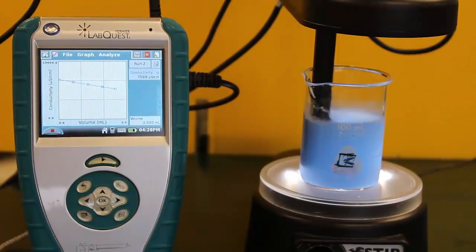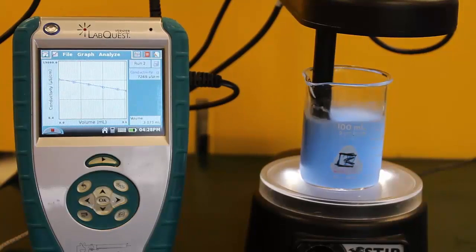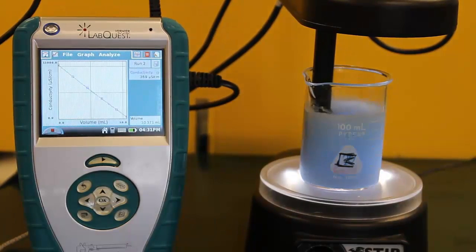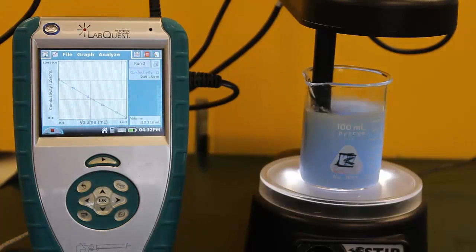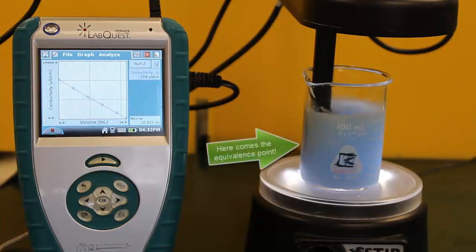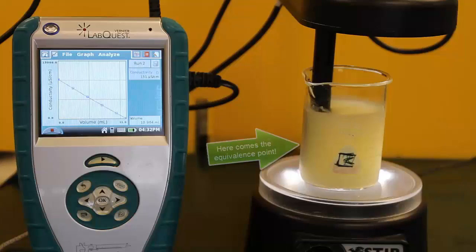Notice the rapidly declining conductivity of the solution as we slow down the video near equivalence. Watch closely for the color change - there's the equivalence point as the bromthymol blue indicator turns yellow.